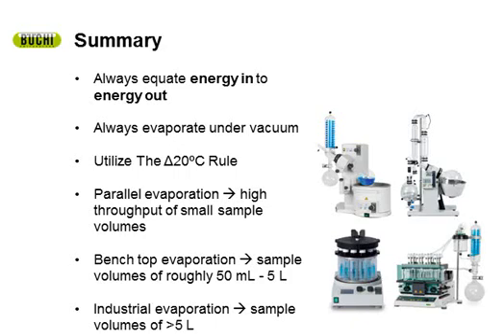And now the last one. When is it advantageous to use a parallel evaporation technology? A, evaporate at a lower, more gentle temperature. B, increase analyte yield. C, automate the process. D, all of the above.